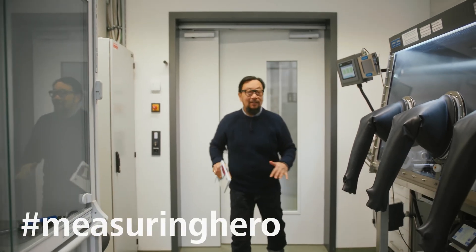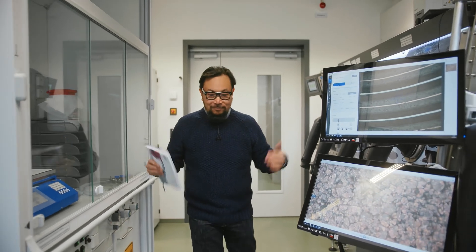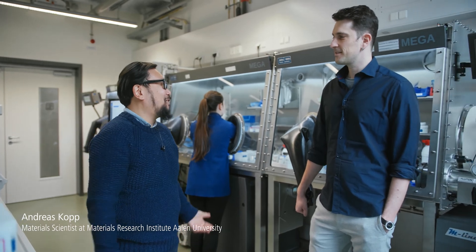Hey, Measuring Hero. Jay here. Today we are back at one of the material research labs in Aalen University to keep going down our journey on analyzing batteries. Andreas has been kind enough to welcome us back. Andreas, thank you for having us back.